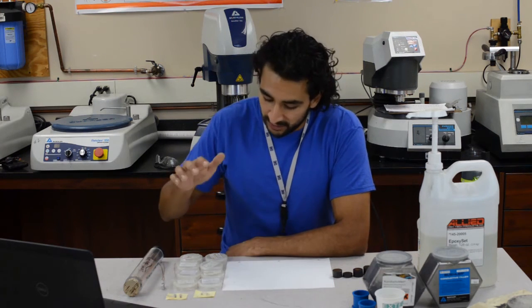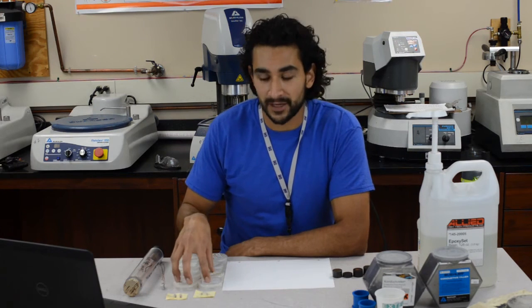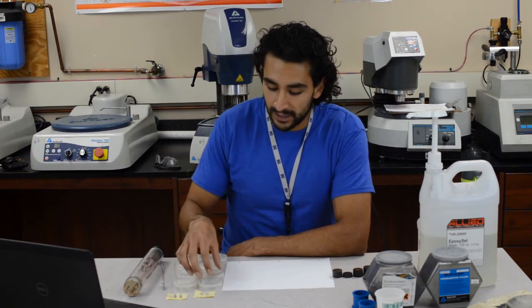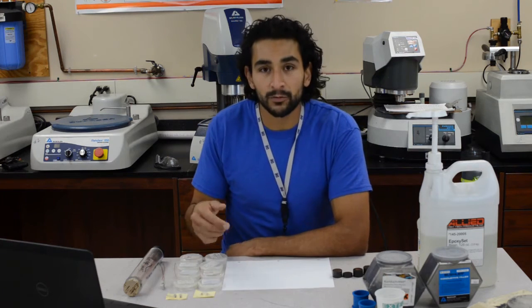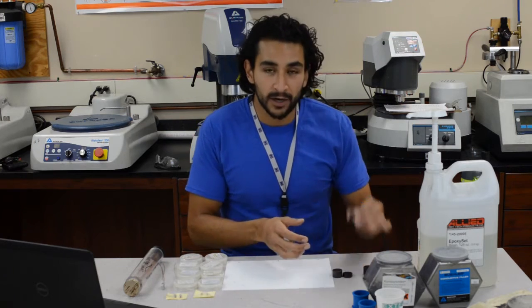Now, as a researcher, it's very important that you ask yourself: why am I doing this? In this case, it means that you need to know everything about your sample — who made it, how did they make it, and what are you trying to find out by looking at its structure. So don't be afraid to ask these questions. I'm sure someone in the lab, probably the person who gave you the sample, will be able to answer anything you need to know to actually have a goal and a purpose for doing this.